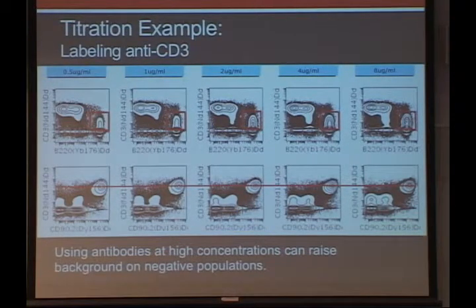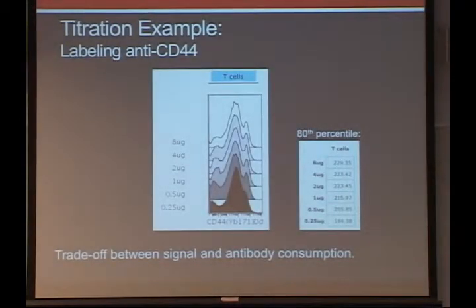So it is really important to monitor the upper end of that titration curve as well to ensure that what you're measuring is really a specific epitope that you're intending to measure. Again, stressing that that full titration range, the 7-step that we use, is really ideal.